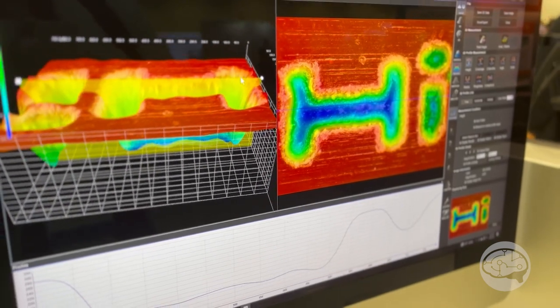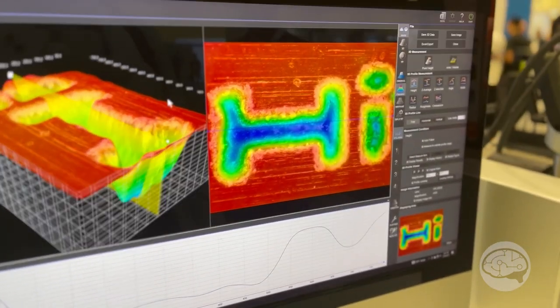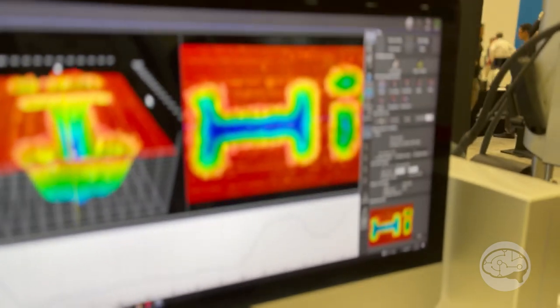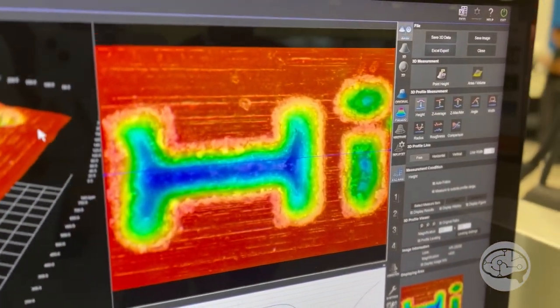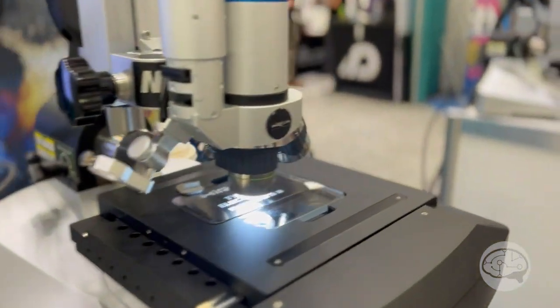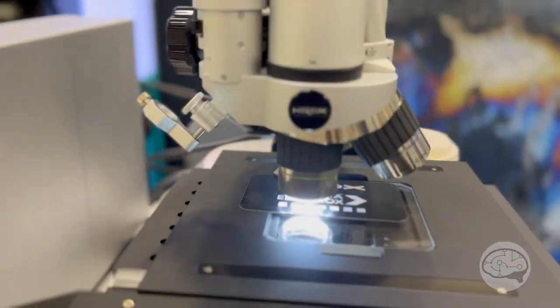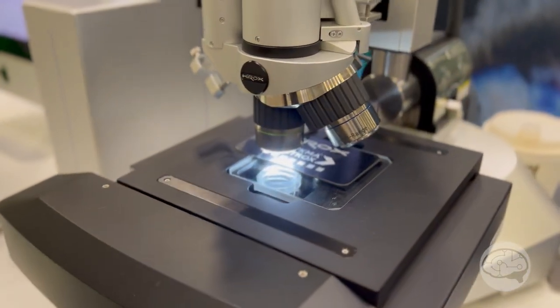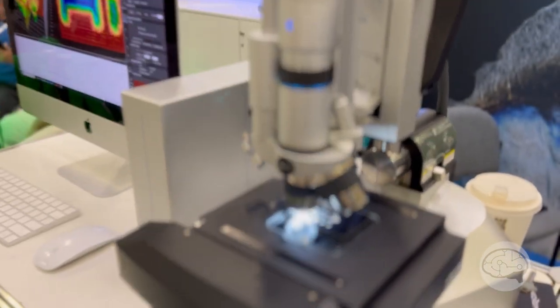It pairs seamlessly with our optical microscope and gives you nano level profilometry. What we can do is on the optical side of the microscope we find the area we're looking to measure, then we'll delta shift over to the chromatic confocal sensor, and from that we're able to get our nano level measurements.